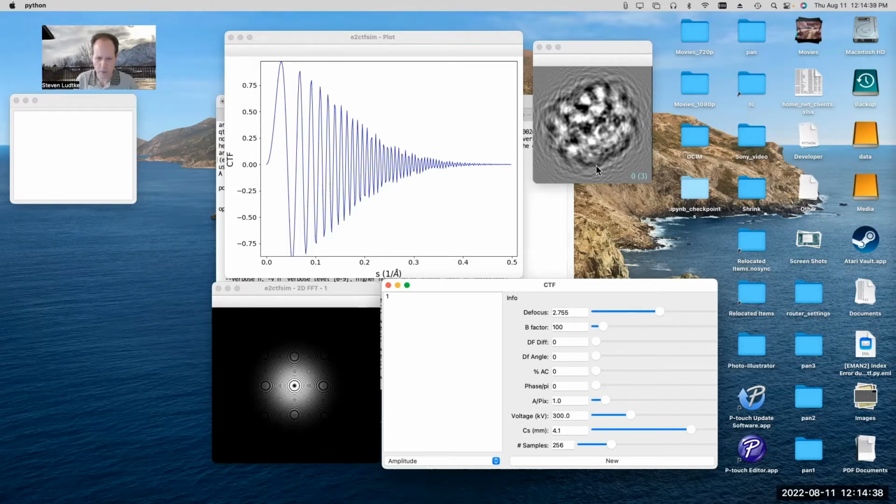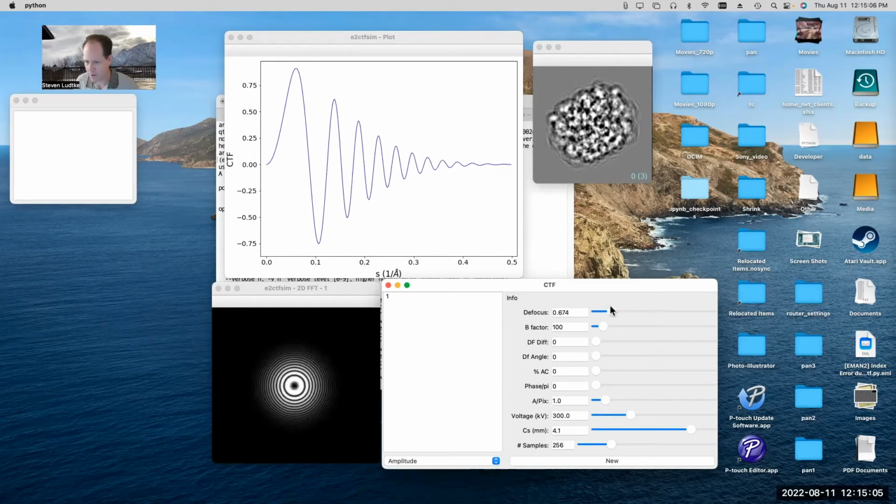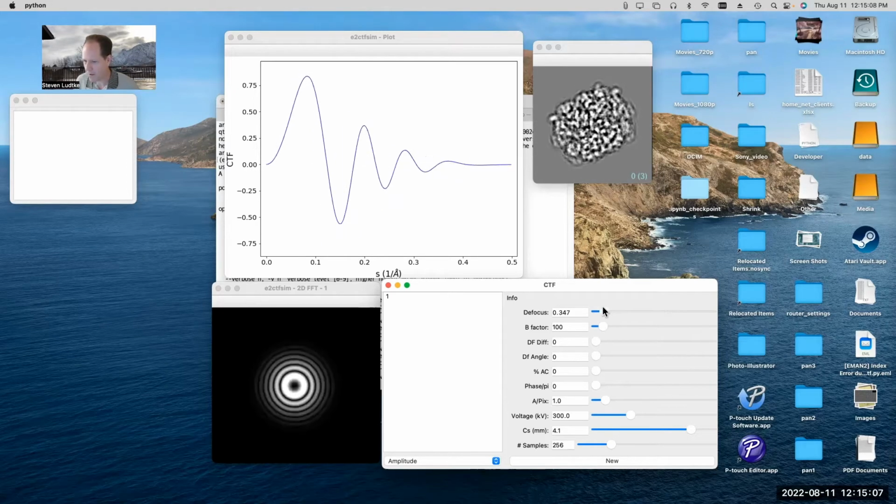So people who go into Relion, because Relion suggests the same thing too, but if you look at what people actually do, they often use fairly tight boxes in Relion, and they're actually shooting themselves in the foot when they do that, because they're going to make their structures a little bit worse, not better. Now it will often make things run a little bit faster, and that is of course something that you have to take into account in some cases.